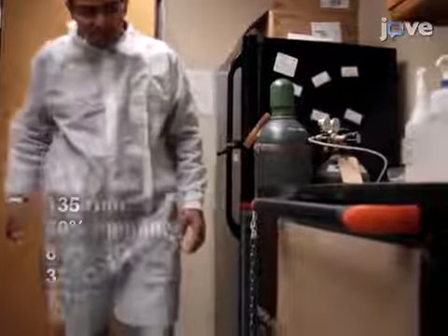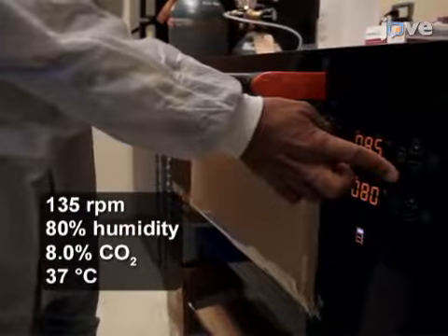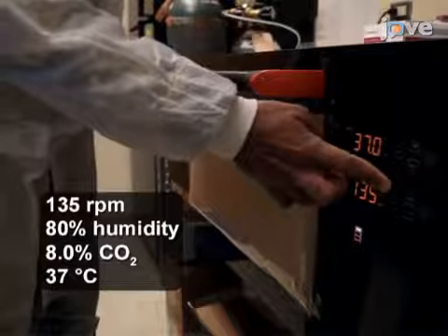The incubator shaker for cell establishment should be operated at 135 rpm, 80% humidity, 8% carbon dioxide, and 37 degrees Celsius.